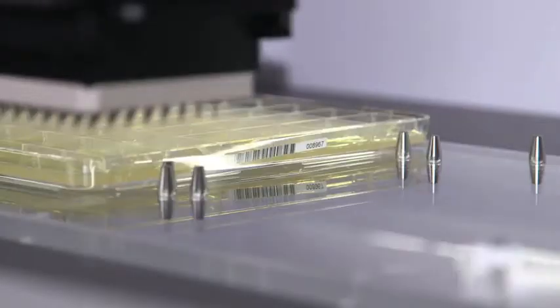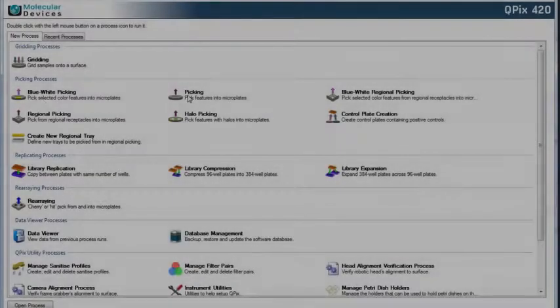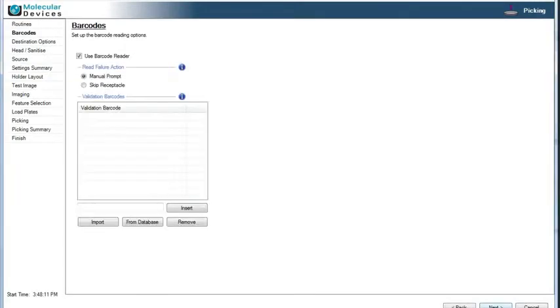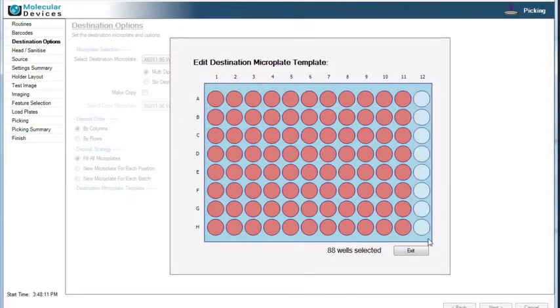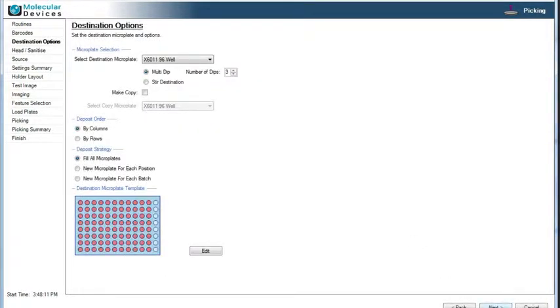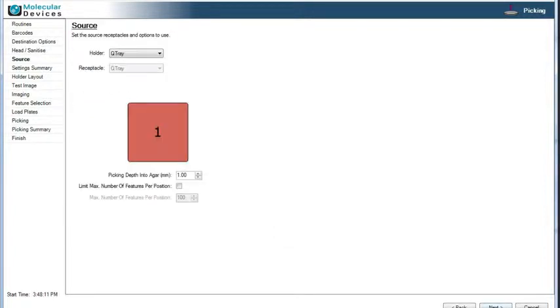Some of the unique features of the QPIX 400 series which enable us to be the industry leader are our agar height sensor, automated colony detection, and data tracking, which are all powered by our simple application-driven software. This means the QPIX can automatically identify the height of the agar, ensuring that pins hit colonies for maximum pick efficiency. We have integrated barcode reading to monitor microbes through the complete process of plating and streaking, through picking, replication, and cherry picking.